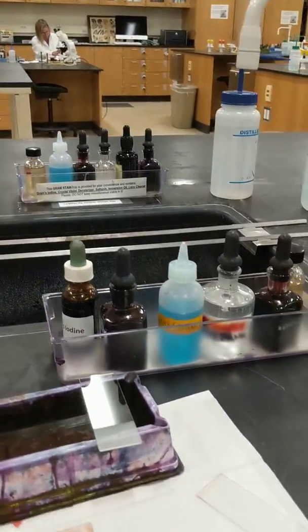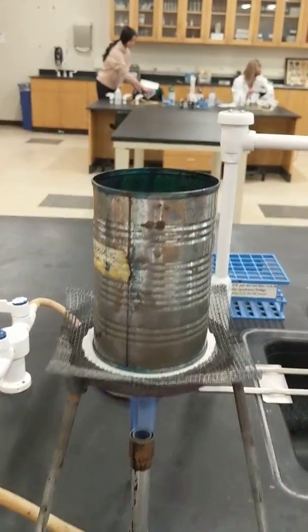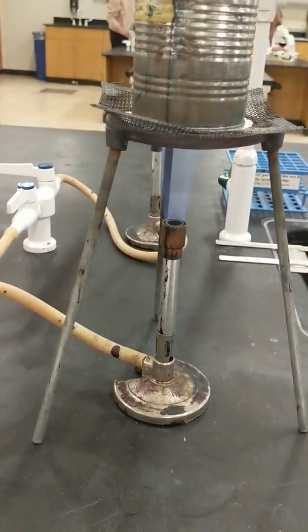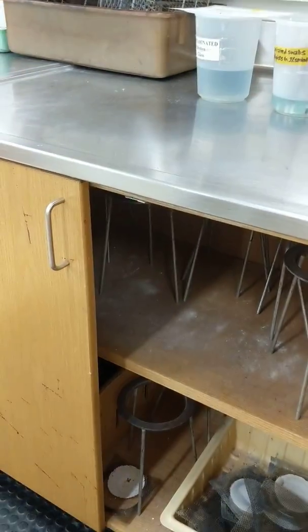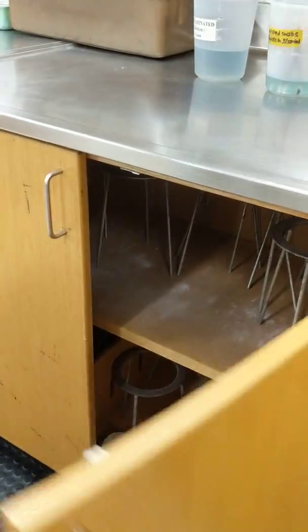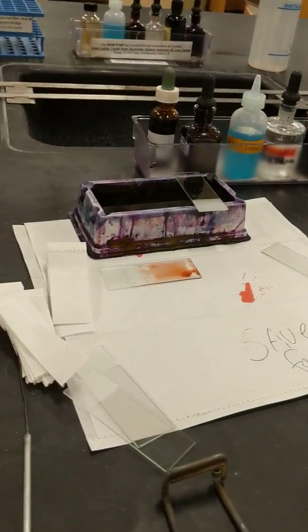You will also need your gram stain materials, and again, you're going to need a tin cup with boiling water inside of it, your Bunsen burner on, and then probably your rack as well. I'll go over the other stuff a little bit. You can find the tin cans located on the side of the room over here, and we have our stands and our diffusers and the tin cans in there as well. Make sure that the tin cans are empty before you put them back. I'd also suggest that you put a little bit of a paper towel on the side.